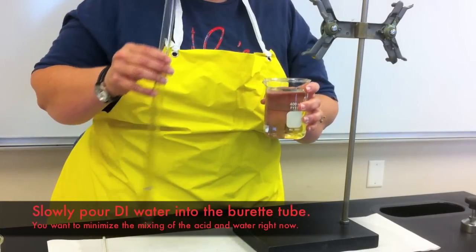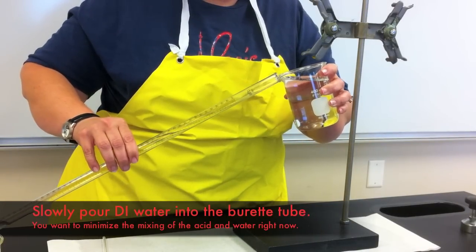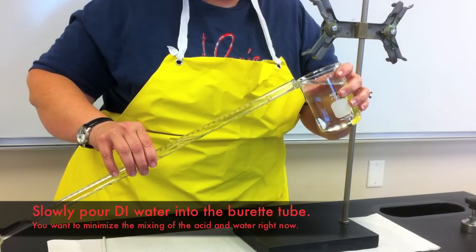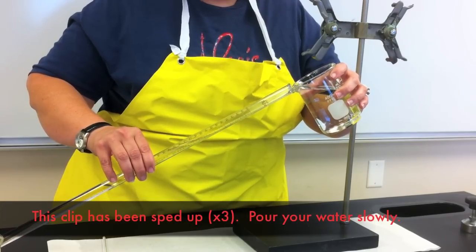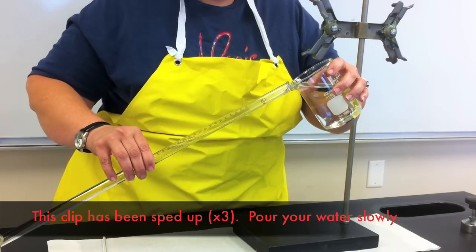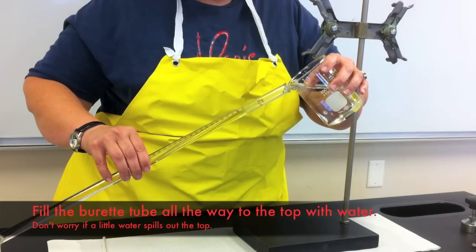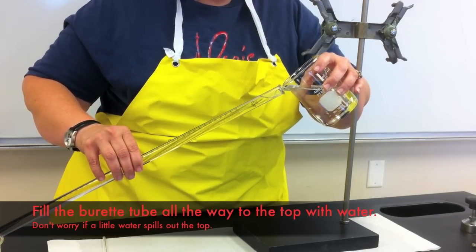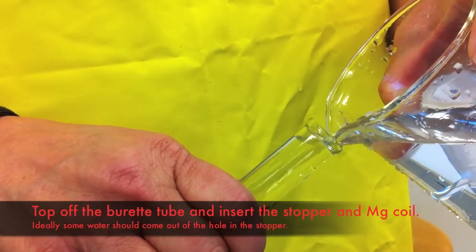With the hydrochloric acid in the burette, you will need to fill the remaining volume of the burette tube with distilled water. Do this very slowly. You do not want to disrupt and mix the hydrochloric acid solution at the bottom of the burette, so pour gently and slowly to fill the burette to the top with distilled water. Make sure that absolutely no air is present in the burette, so fill it all the way to the top, even such that it is overflowing.